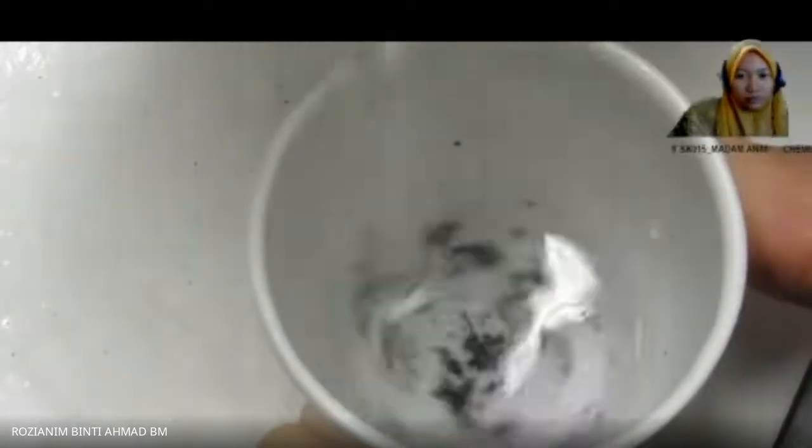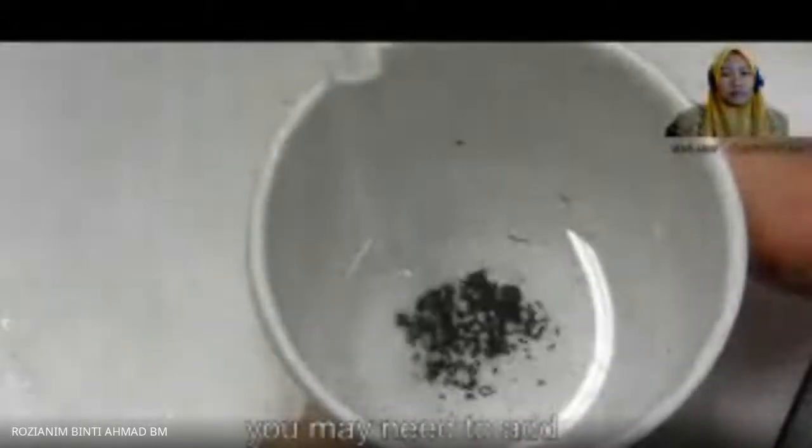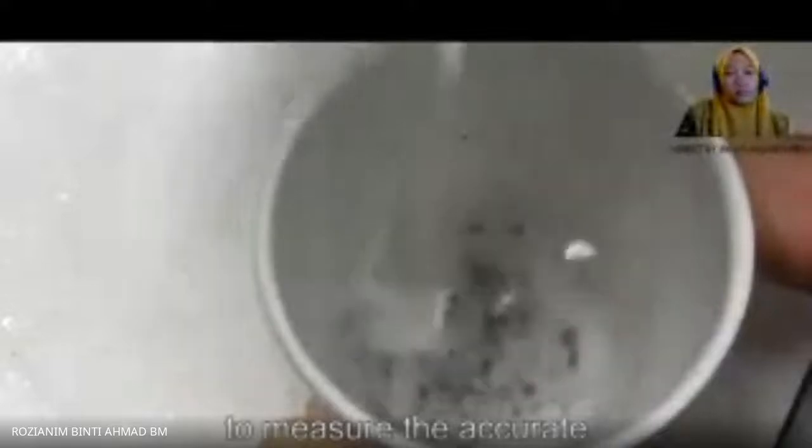If the solid is zinc, there will be a reaction and gas bubbles will be formed. If that happens, you may need to add more than 10 milliliters of hydrochloric acid. That is why it is not necessary to measure the accurate volume of hydrochloric acid.